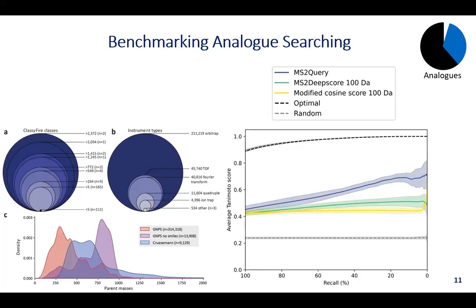So we need to take into account that there is bias in the library. If we compare the contents of the library with a bacterial extract, we can see that the mass distribution alone is already completely different. In other words, these models are also biased, and you will have to validate the results. That's basically what I'm trying to say.